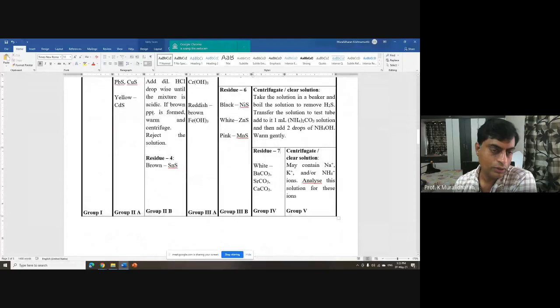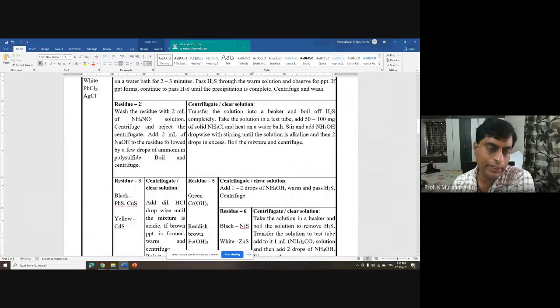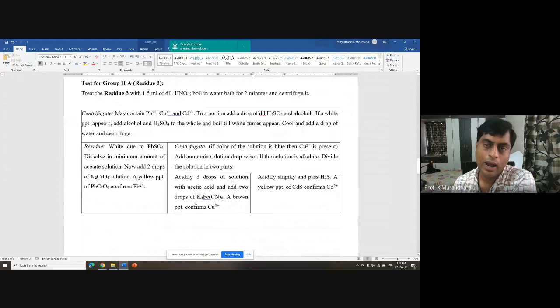Residue 2 is not there, right? Residue 2 you will be separating. Again, residue 3 and residue 4 you will be getting. So residue 3, you take it and continue to do this. I think there's no need to.